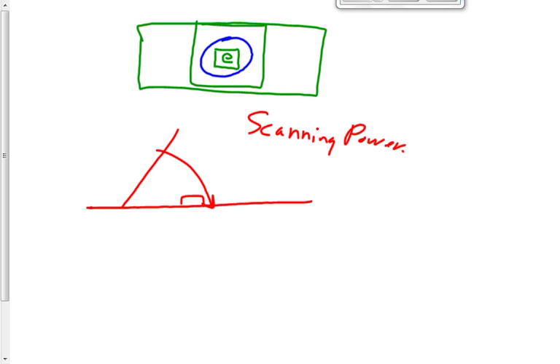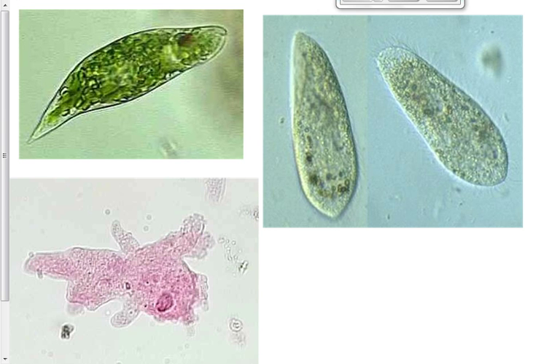All right, everyone follow how to make a letter E wet mount? That's the one you should do first. After that, it doesn't really matter what order you look at them in. The amoeba and the paramecium are easier to find than the euglena. The euglena is quite small. You may want to save it for last after you've practiced up a little bit, to give you some idea what everything looks like so you know what you're looking for.